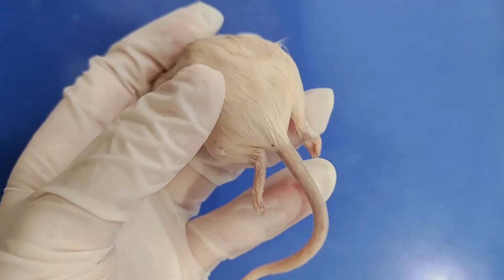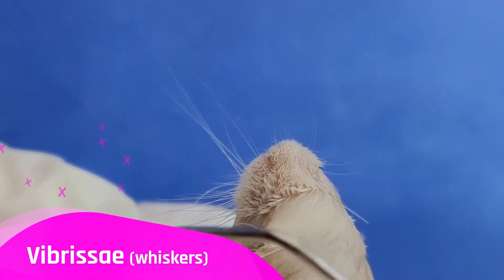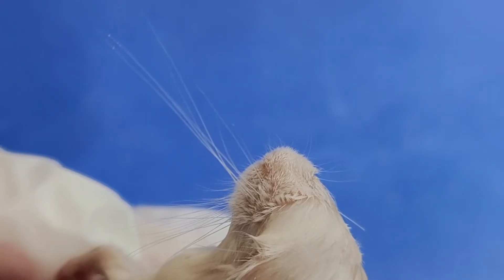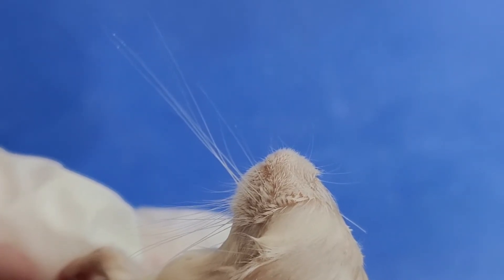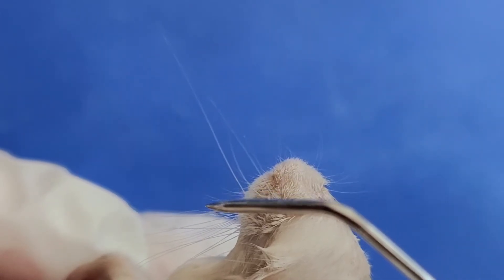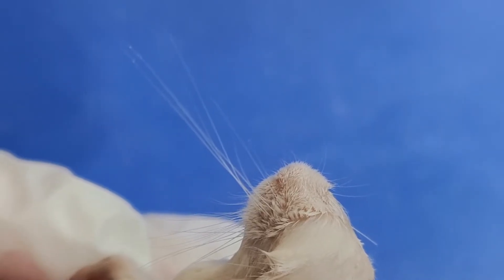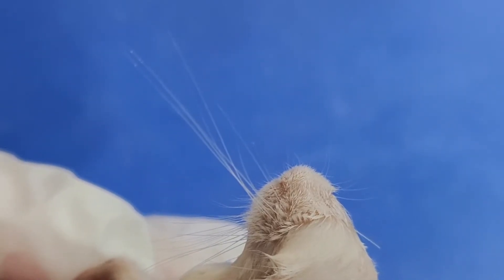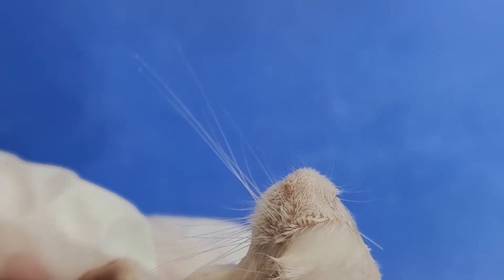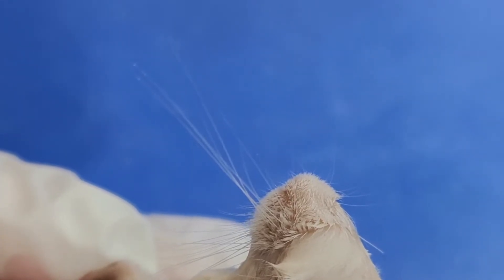We'll take a look at the anterior side, or the head, first. These are the vibrissae, or whiskers. The mouse's whiskers help it sense the world far better than it could with just its eyes alone. When a whisker touches an object, it bends and sends a message to the mouse's brain. As the mouse moves through the landscape, it feels all the objects and textures near its face with its whiskers and constructs an image of the world around it, kind of like you would if you felt your way through a dark room.